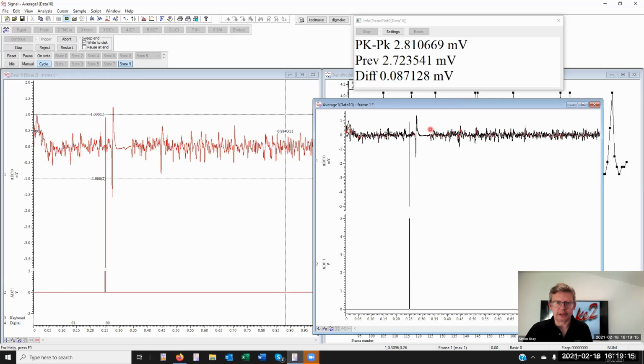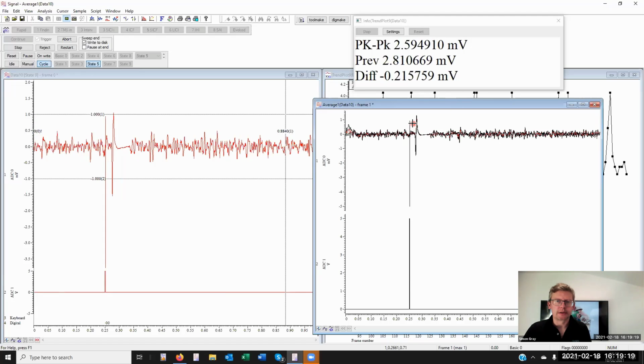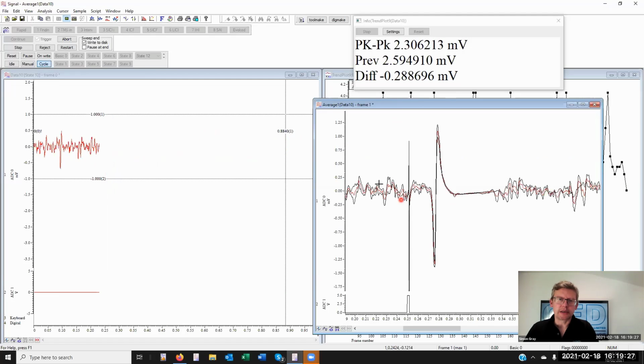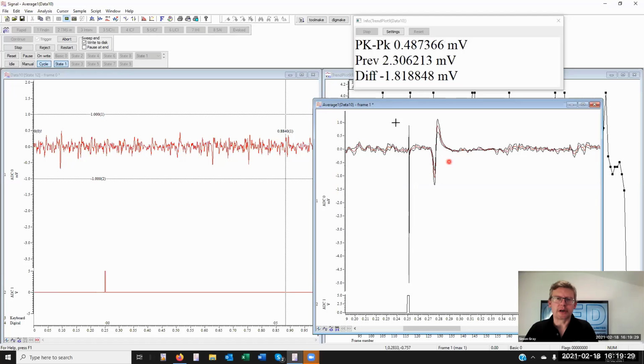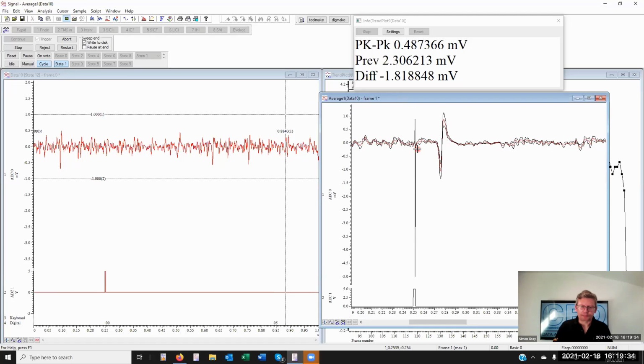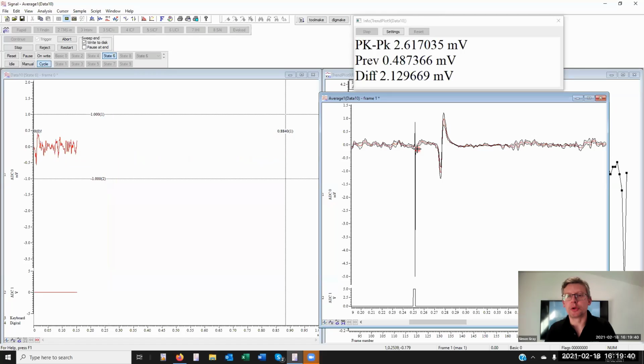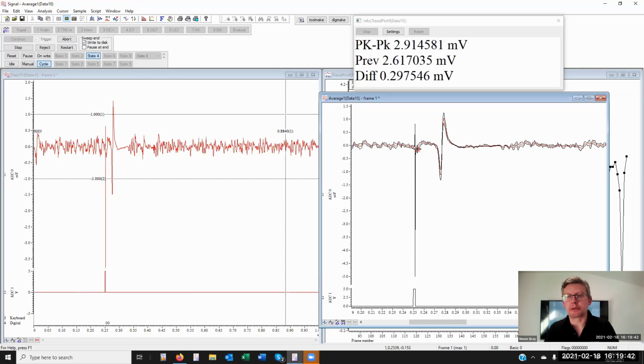There's the second, and now we start getting error bars. There we go. Once again, shift, drag the line to expand the area. Now, this is another data file. I can save this as a CFS file, and with it come all the active cursors and the fit functions that you have in your original data file.